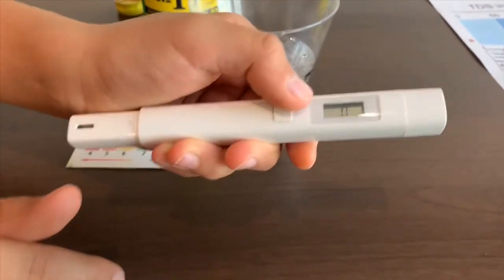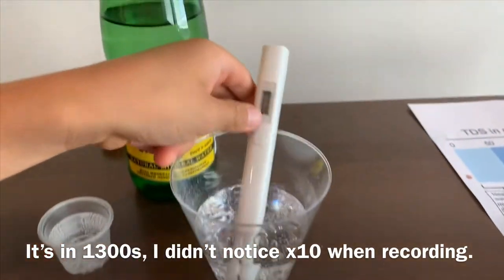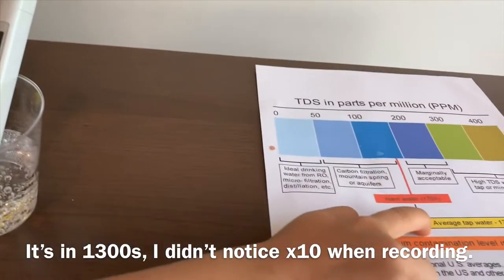Turn on the TDS tester, make sure it says zero, and put it in. It's in the 300s. That is average tap water.